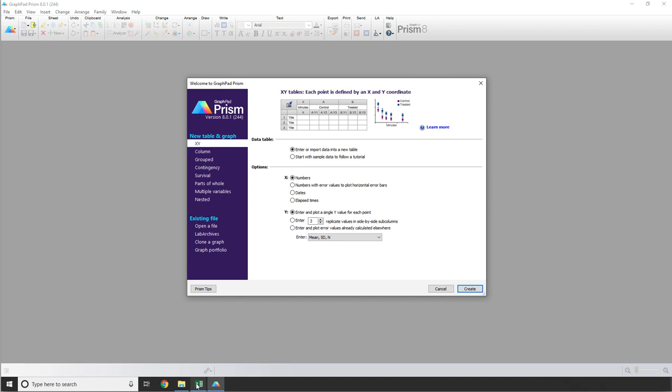The first and most obvious way that you can get your experimental data into Prism is just to type it in. It's not very exciting or complicated, but it is an option. The next option you have for getting your data into Prism is with a simple copy and paste.